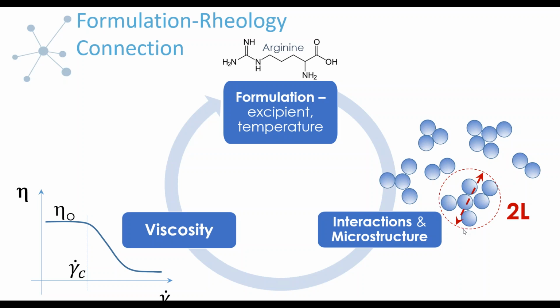And then we're also going to look at temperature, because another common thing we've realized from our customers is that you don't only work with a formulation at room temperature. Oftentimes it's in cold storage and you take it out and want to start working with it before it comes to room temperature, or you may be interested in how these properties change as they're injected into the human body. And of course, room temperatures vary as well. So we wanted to look at the impact of temperature on the viscosity of these concentrated proteins too.